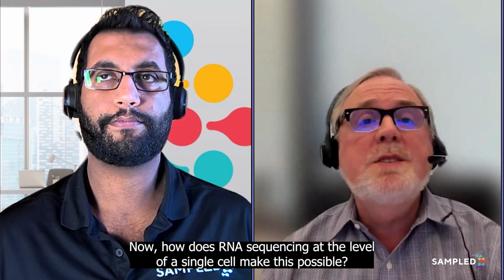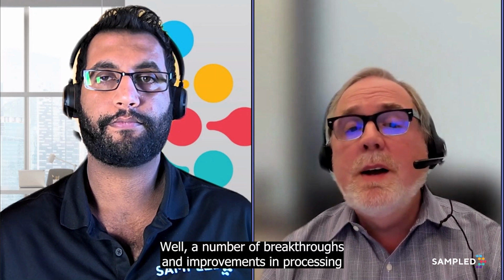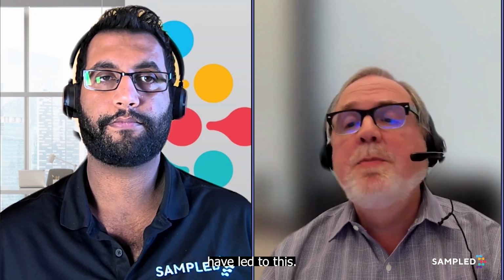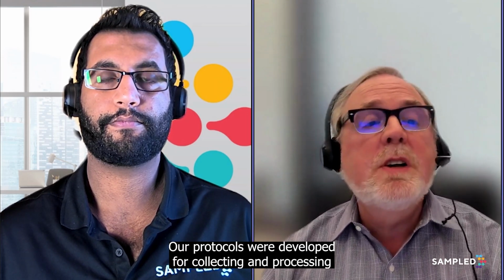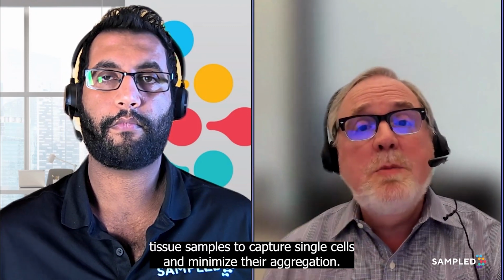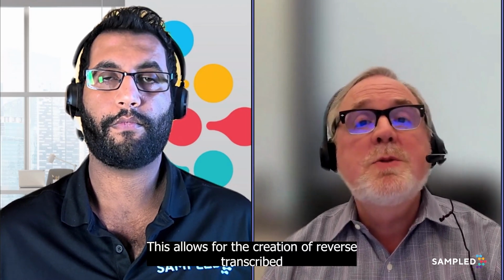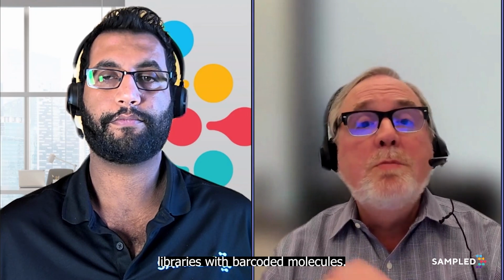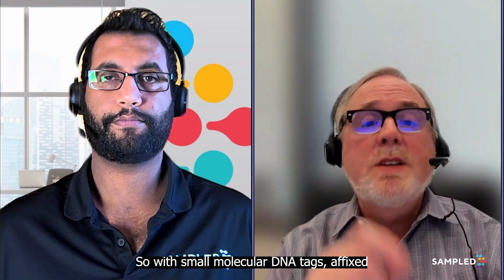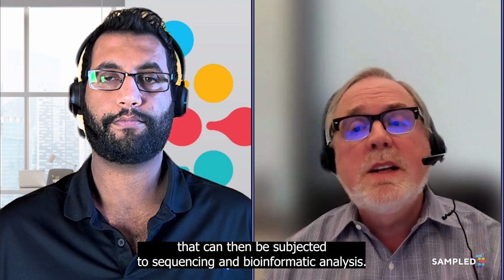Now, how does RNA sequencing at the level of single cell make this possible? Well, a number of breakthroughs and improvements in processing have led to this. Protocols were developed for collecting and processing tissue samples to capture single cells and minimize their aggregation. This allows for the creation of reverse transcribed libraries with barcoded molecules, so with small molecular DNA tags affixed, that can then be subjected to sequencing and bioinformatic analysis.